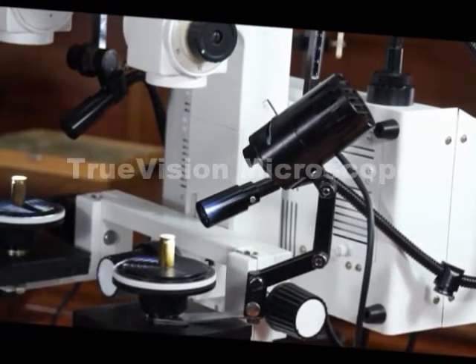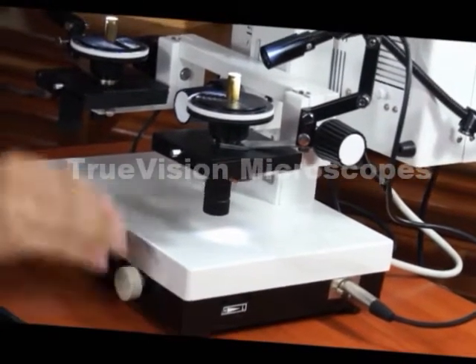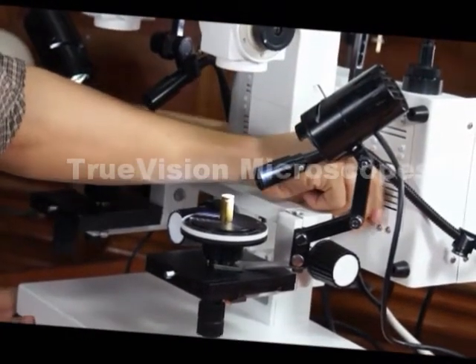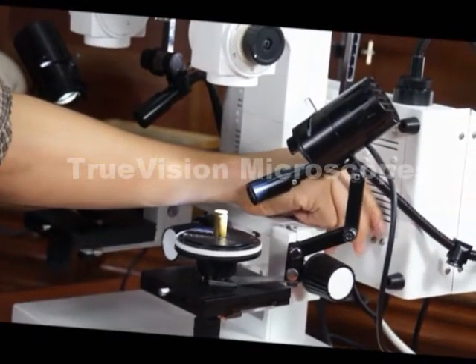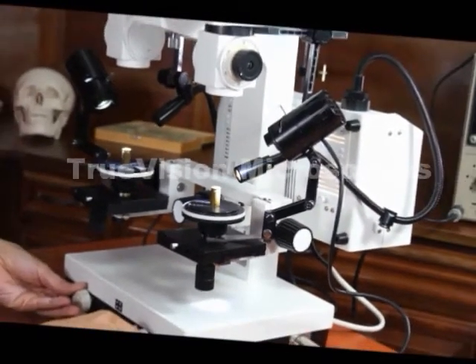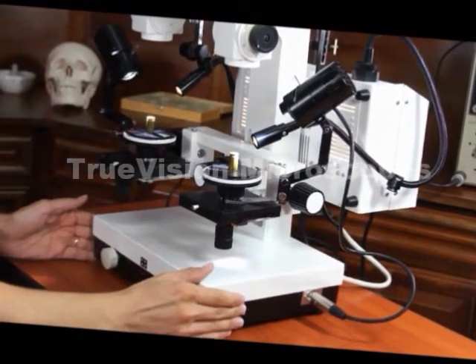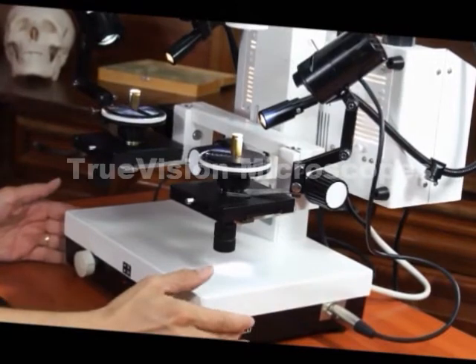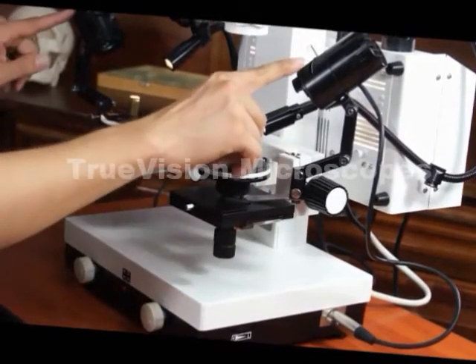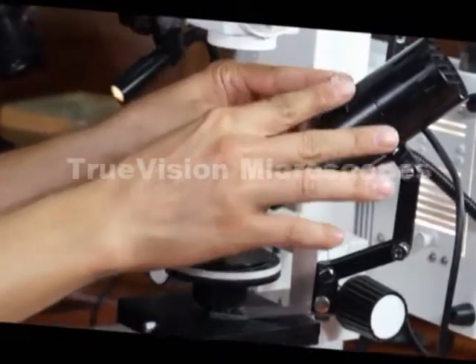We have another model that has illumination only in the bottom and it's not nearly as bright. This model is very bright, very clear, very white light. I'm turning on the back fiber optic lights and turning off the LEDs. These are the LED lights. This particular knob focuses the light.